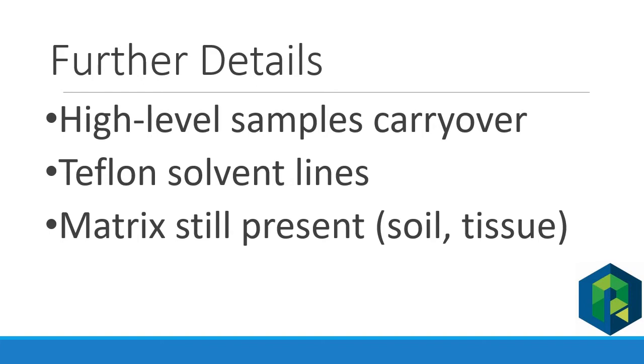However, as you saw on the previous slide, our background levels of PFAS are very low and are only a fraction of the spiked level that we put in the sample. We think that's mostly due to the fact that these Teflon lines have not been replaced in 4 years and have seen many different solvents flow through them. So the background levels of PFAS are extremely low at this point.